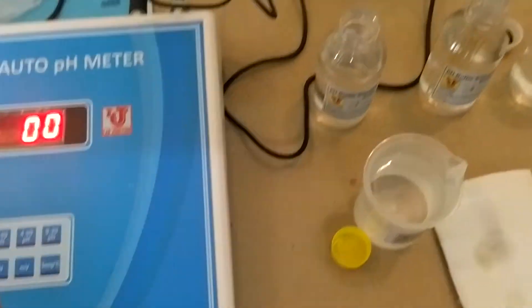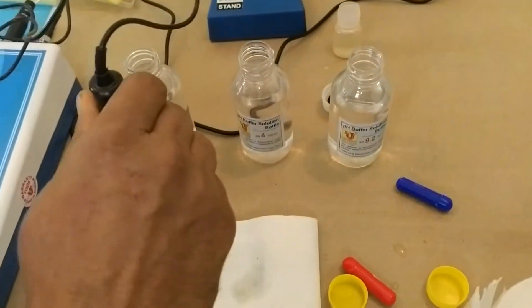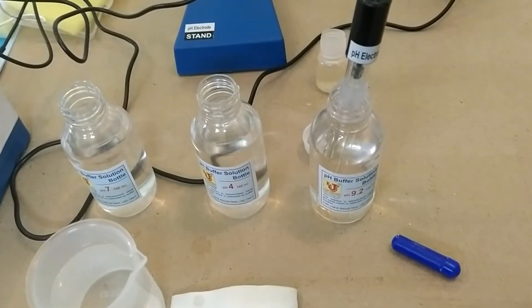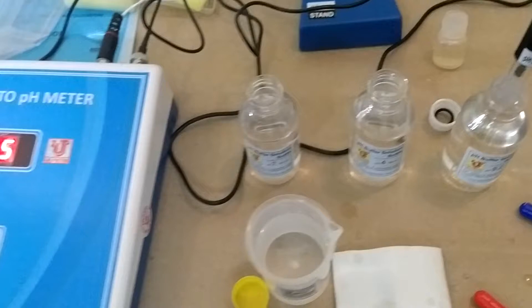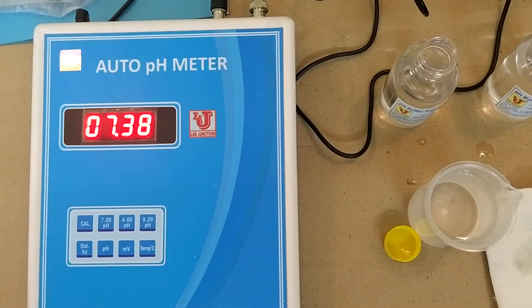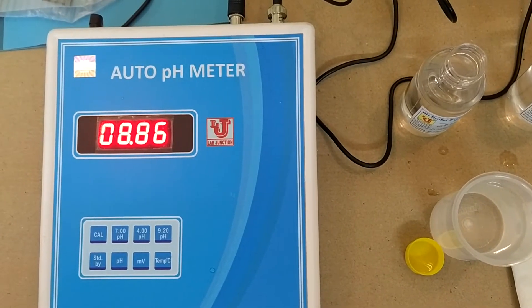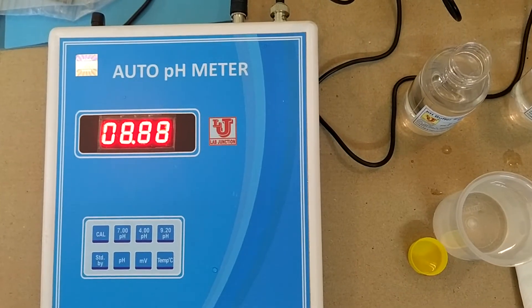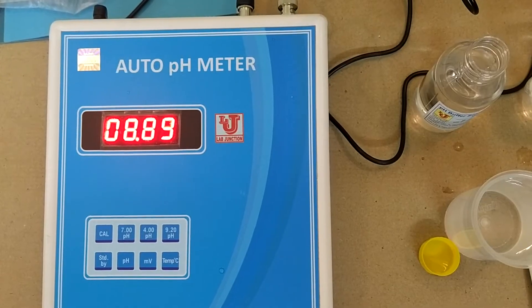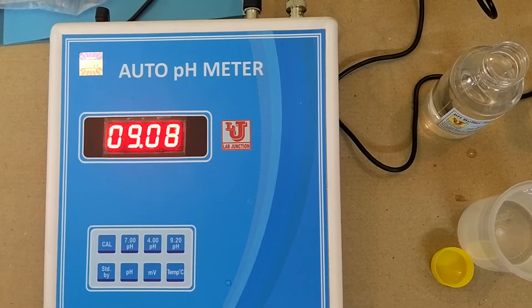If you want 3-point calibration, then also dip in 9.2 pH. Click to scan 9.2 pH, and then press 9.2 pH.